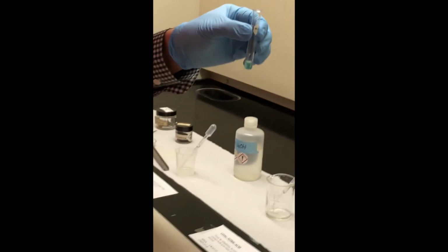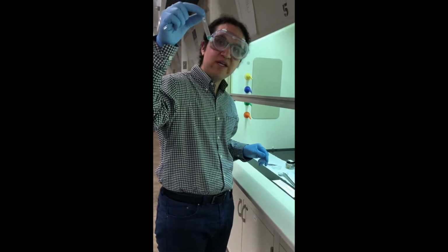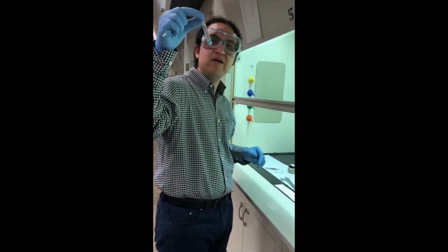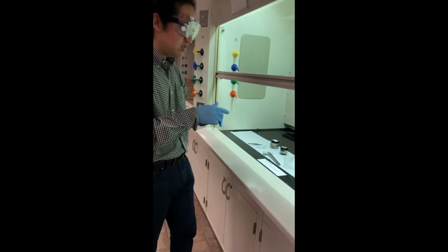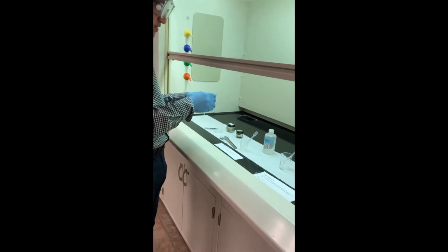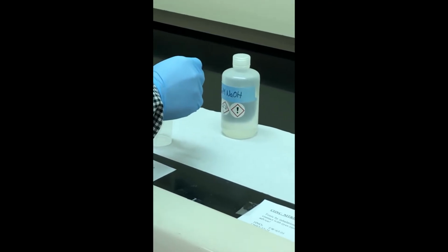We're going to pause and repeat this process for our 2 other tests. Our solution in test tube 1 is currently copper nitrate. We're going to precipitate out copper hydroxide via addition of roughly 20 drops of sodium hydroxide. So I'm going to add the sodium hydroxide, 6 molar.